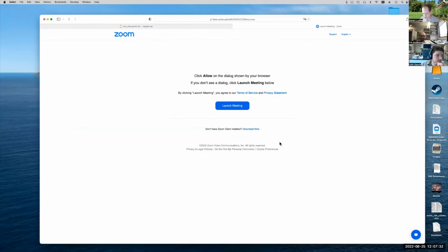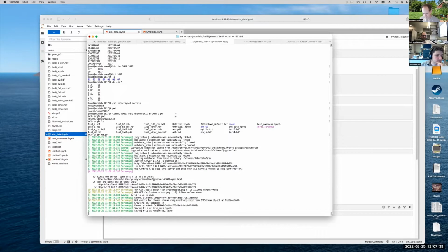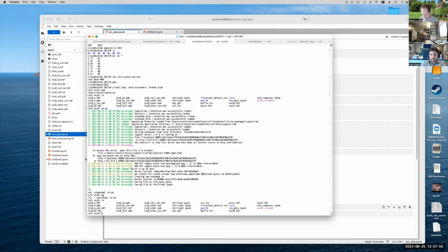So let's talk about maybe why that is bad. So let me share my screen, and I'm not showing you Lan's actual data here. I'm going to just do some more simulation stuff myself. Yeah, let's go back to some of the stuff we were doing previously with adding noise and CTF to things, and take a look at that.